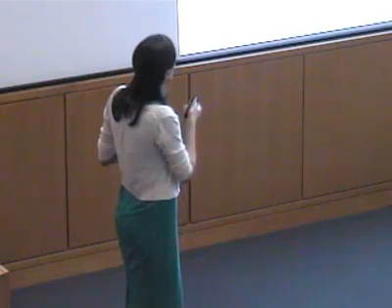Similarly, the idea that we can just read oxidation state from a comparison can also be misleading. Here I'm showing an example where we compare an iron 4 to an iron 5 complex, and in fact they're at exactly the same energy.